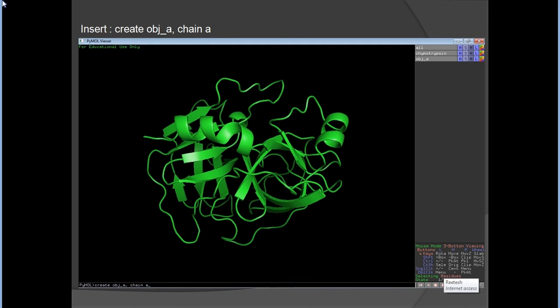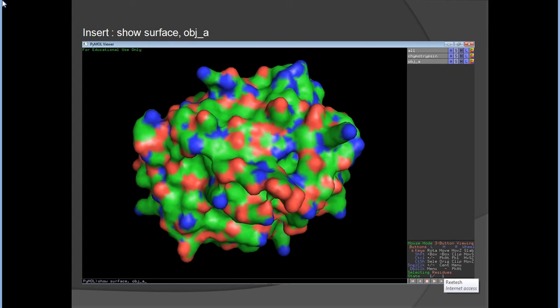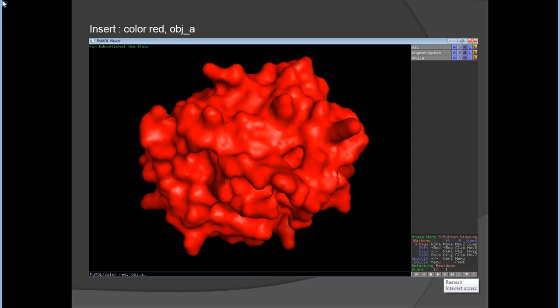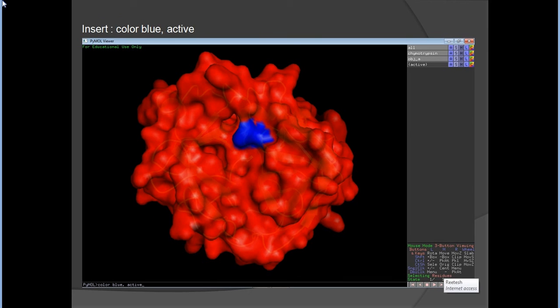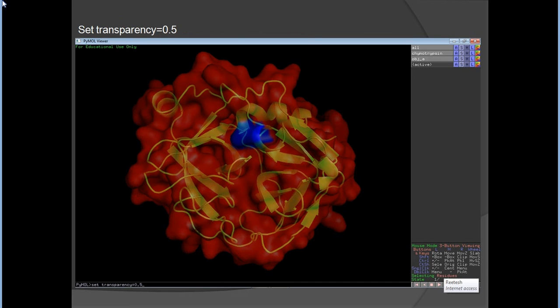For surface representation, open chymotrypsin or chymotrypsinogen, hide everything, then type 'show surface'. To create objects, type 'create obj_a, chain A' — this creates a copy of object A from chain A. Then type 'show surface, obj_a'. Color it with 'color red, obj_a' or 'color green, obj_a'. To highlight the active site, type 'select active, (residue) and chain A', then 'color blue, active'. You can also set transparency with 'set transparency = 0.5, 0.25, or 0.75'.